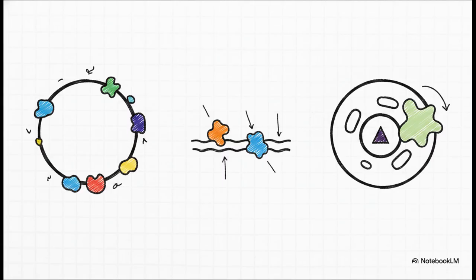Now, liquid-solid chromatography is incredibly widely used, and it actually subdivides even further based on the exact retention phenomenon at play. Let's rapid fire through these. First, adsorption chromatography, where solutes bond to the stationary phase through physical or chemical interactions. Second, ion chromatography, where the stationary phase has modified ionic sites that exchange mobile counterions with ions in the sample. And third, molecular exclusion chromatography, which relies on selective permeation based strictly on molecular size.